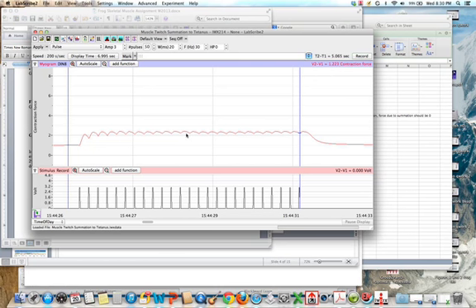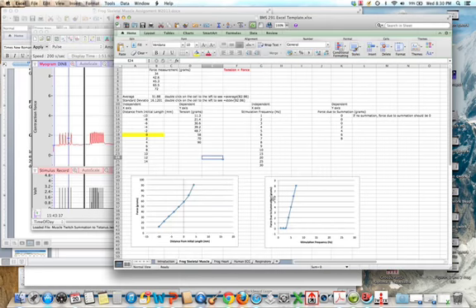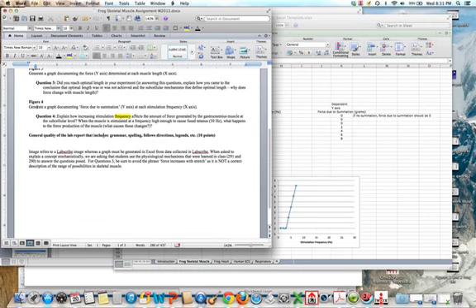Once you get those numbers for each of the different forces that you have here, you can put it into your stimulus frequency, which you have listed here under Hertz, and then you can put in your force due to summation and what it came up with, and then you'll generate a graph accordingly here that you can copy and paste into your Word document, which is over here.